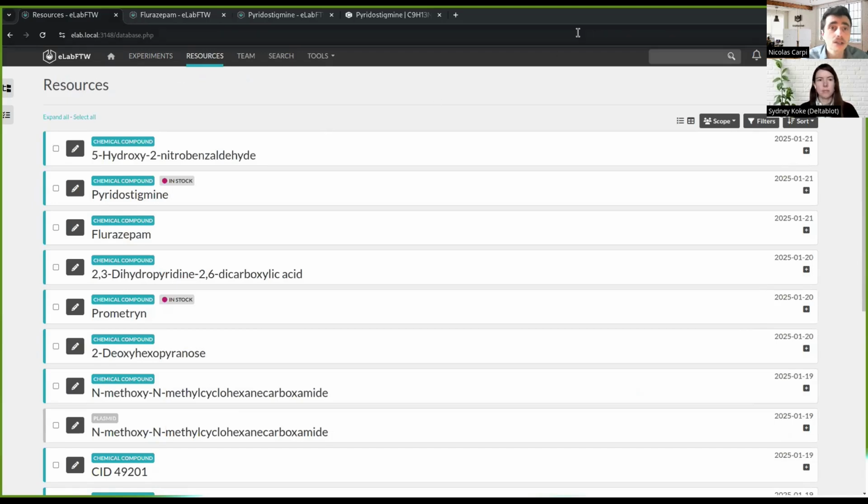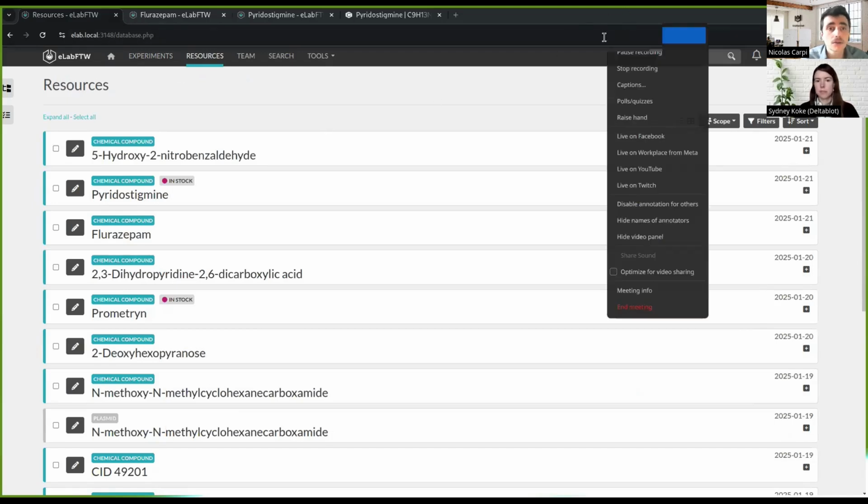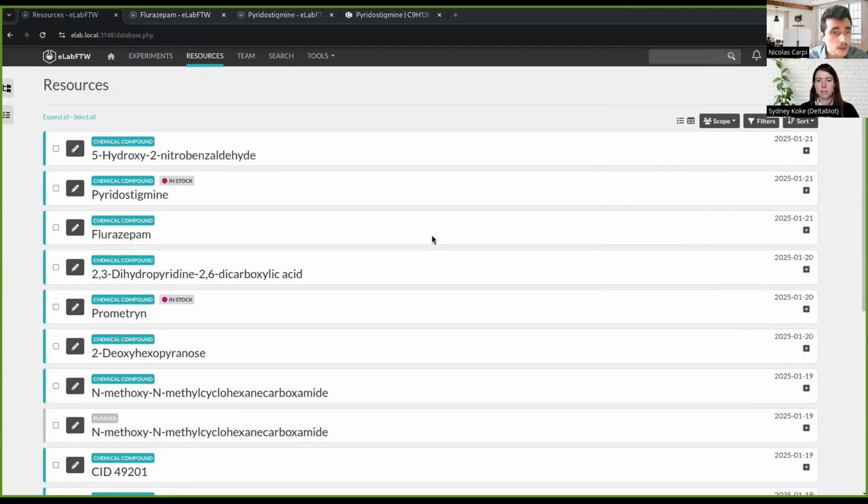So I will stop here. I see that there are already quite a few questions in the Q&A. So Benjamin, can I search the storage browser with CAS number or SMILES? Names can be difficult in chemistry. Indeed, they can.